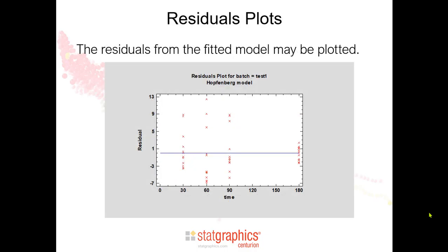Since nonlinear least squares is being used to fit the dissolution models, it's a good idea to plot the residuals. The residuals are the difference between the observed measurements and those predicted from the fitted model. For a good fitting model, the residuals should vary around 0.